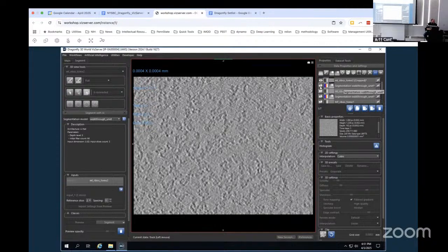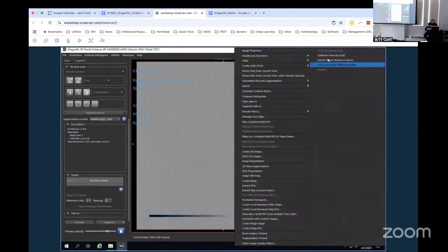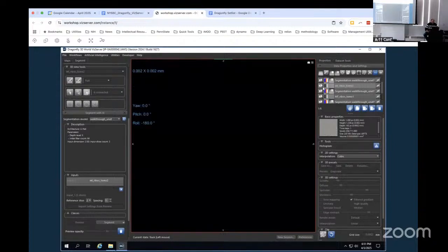All right. Well, I've never had this happen to me, and I've cropped a lot. Very unsure. Let me try just one more time. What? But it's doing it to everyone. Yeah. Okay, so clearly it's not going to work for me. Okay, change of plans. We aren't going to be able to do that exactly right now. But we can do something like it.